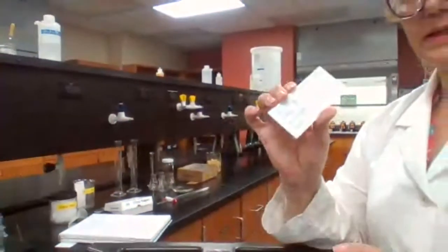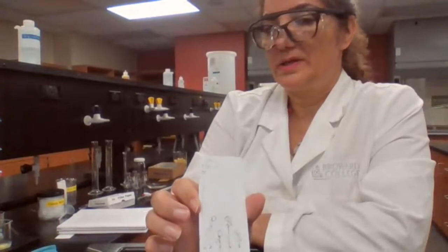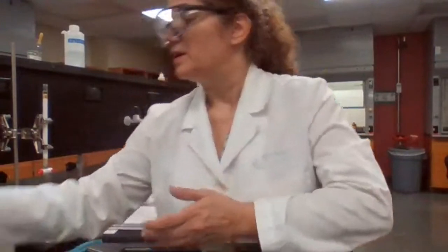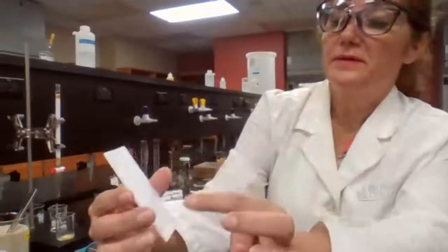And you can include that picture into your lab report. And the screenshot you took from here, if it's good, you don't have to worry about that. You could just use it as a picture for your calculation, and you have the numbers already. The numbers were 7.20 centimeters for the solvent.